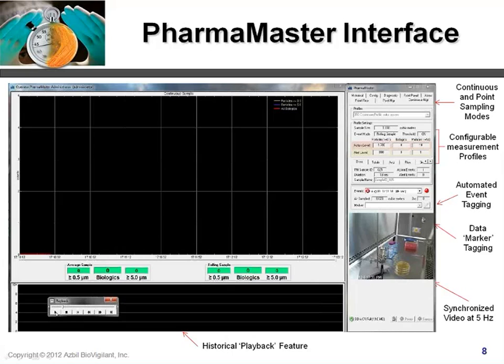And you can see down in the right-hand corner of the screen that video was collected during a sample. And what we're watching is a simple media plating operation being performed in a biosafety cabinet. The isokinetic probe that was used to collect the air sample is visible in the foreground. And you can see on the left-hand side of the screen that there are no particles, biologic or otherwise, detected during the beginning of its test. And in the center of the screen, you can see with green boxes around the zeros the total number of particles that have been detected so far.